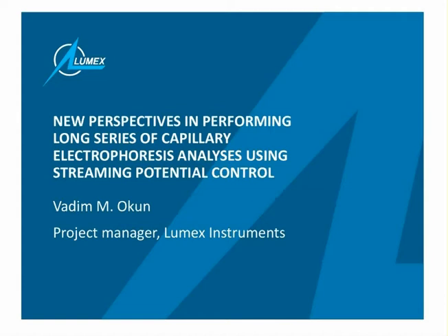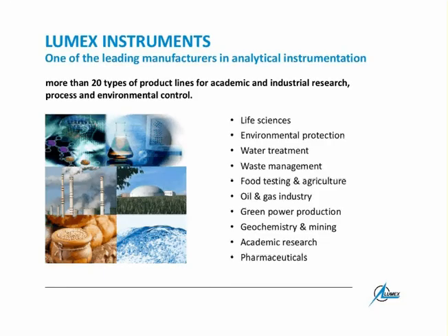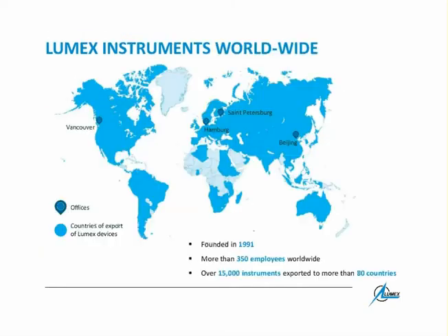I'm pretty sure that some of you, perhaps all of you, have seen my webinars and know about capillary electrophoresis, so I will not show you all the presentations today. As you see on this slide, there is a list of industries and applications where capillary electrophoresis can be used, from, as I mentioned, life sciences to pharmaceuticals.